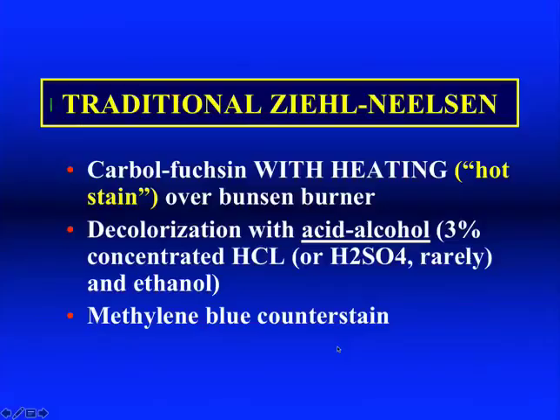So quickly over each, the Ziehl-Neelsen is carbol-fuchsin with heating, so it's a hot stain over a Bunsen burner with the harsh original decolorizer of Dr. Ziehl-Neelsen, which is acid alcohol, and methylene blue as a counterstain.